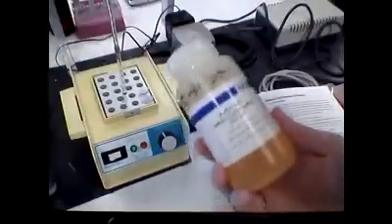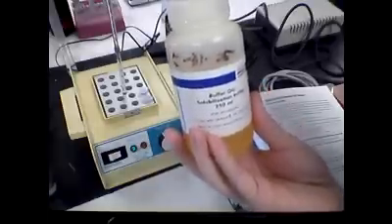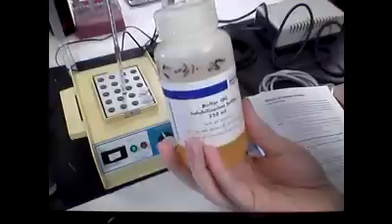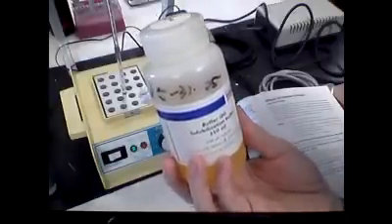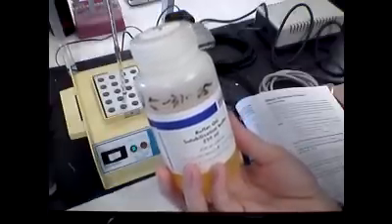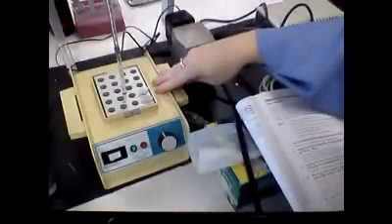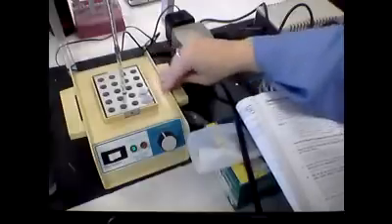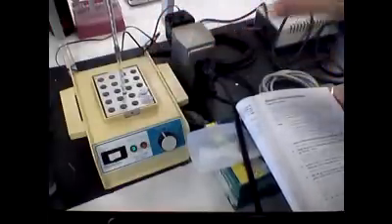Okay, once you get your agarose gel in, you want to place an equal amount of the QG solution, okay? And basically, after that, in order to melt the agarose gel down so you can get to the purified DNA, you're going to have to place it on a heating unit, which this is our heating unit, at 50 degrees, okay, for 10 minutes. Now, during that 10-minute period of time, you need to take the DNA and the gel out, and then vortex it, mix it, spin it, and then place it back in during that 10 minutes.